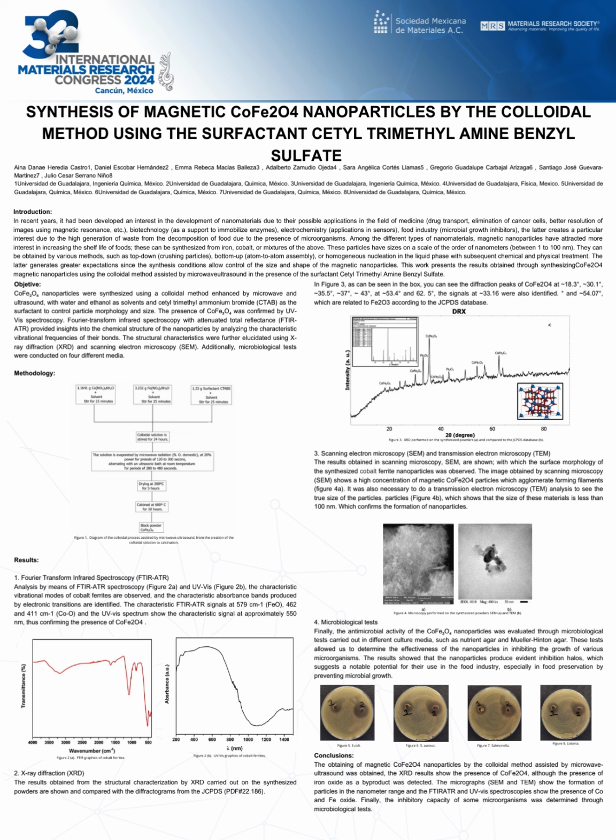The presence of cobalt ferrite was confirmed by UV spectroscopy, and the structural characteristics were analyzed using FTIR, XRD, and SEM. Additionally, microbiological tests were conducted on 4 different media.